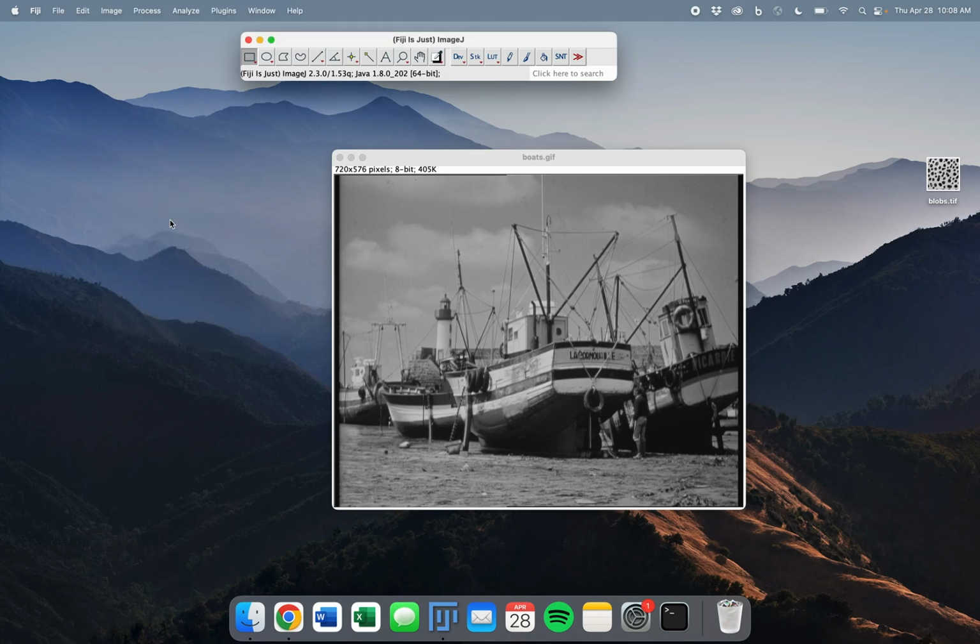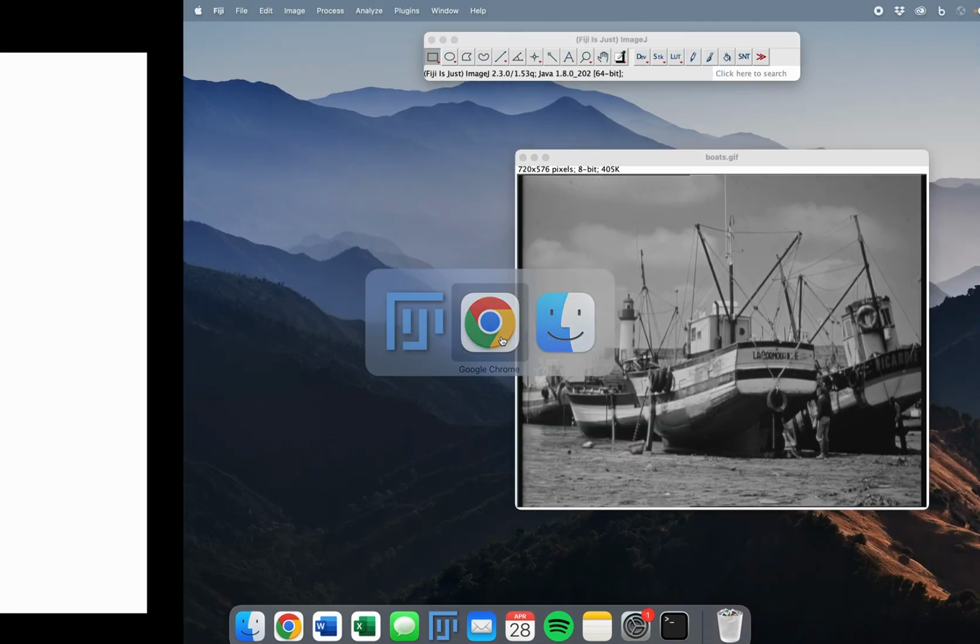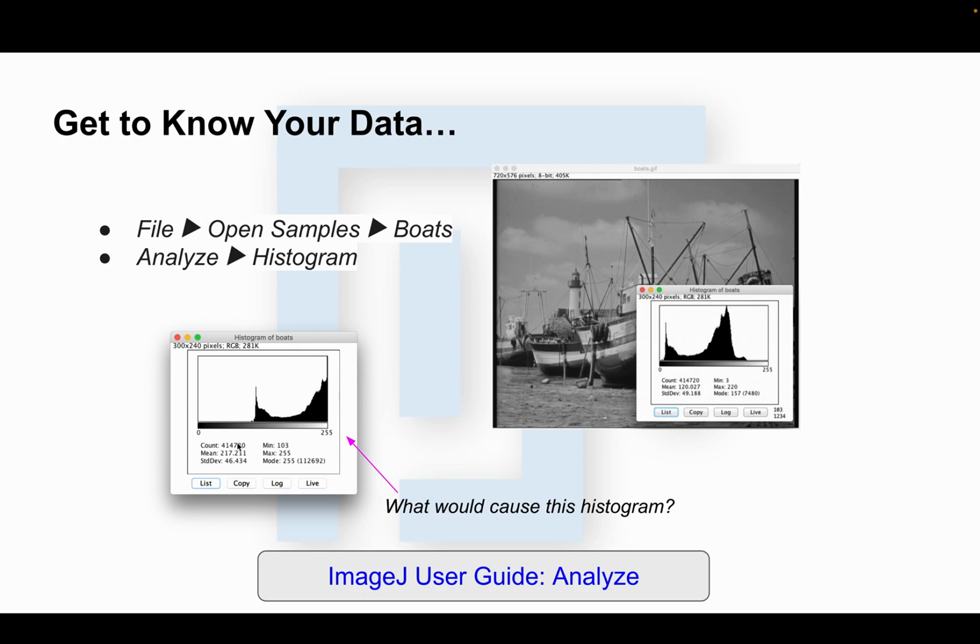So it's really helpful to use this histogram because if your images have a histogram that looks like this, that is a problem. That means you're oversaturating a bunch of your pixels and therefore losing data. All these numbers here would be gone. You're clipping your data.